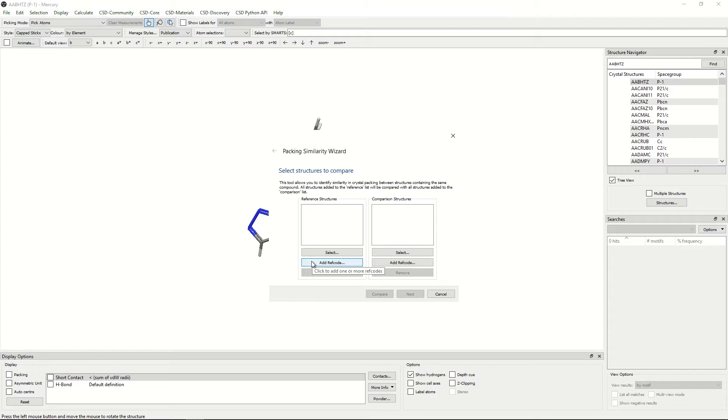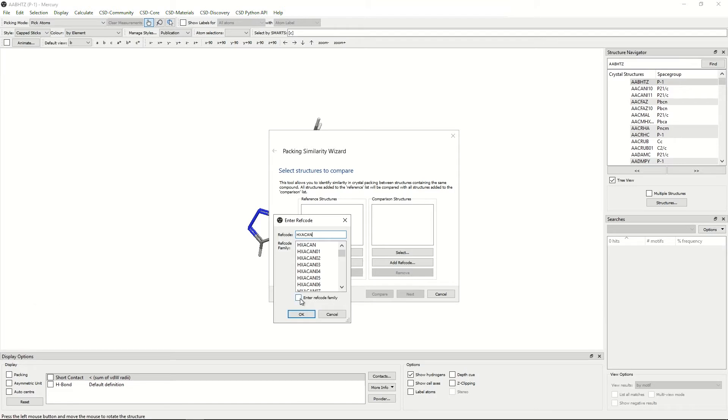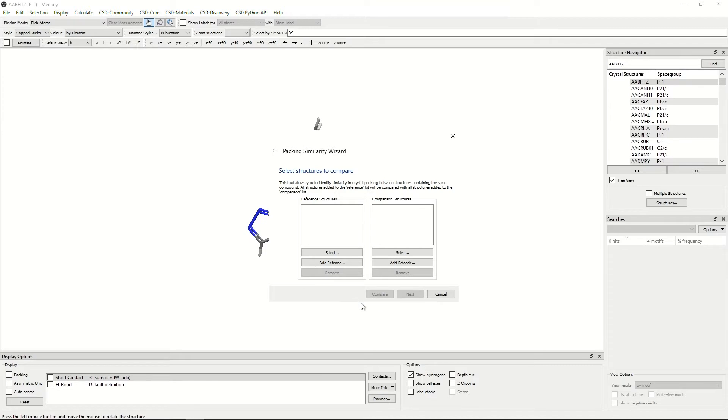The system we'll investigate here is paracetamol and its ref code family HXACAN. So first we will add the reference structures by clicking add ref code, clicking HXACAN, and because we want to compare the whole family, we'll click enter ref code family here. We'll then tick OK.